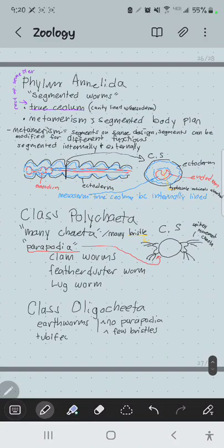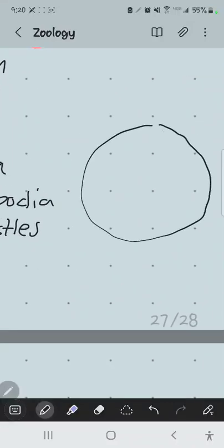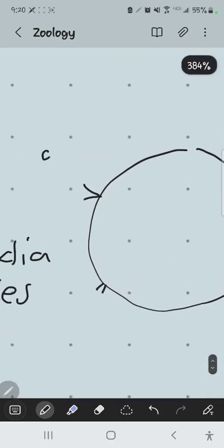And these organisms typically have just two upper and two lower bristle sets. So an oligochaete, an earthworm cross section, looks like this, but there's no parapodia. Typically what you'd see is a pair of bristles on the dorsal and ventral lateral sides of each segment. We have some live earthworms here.